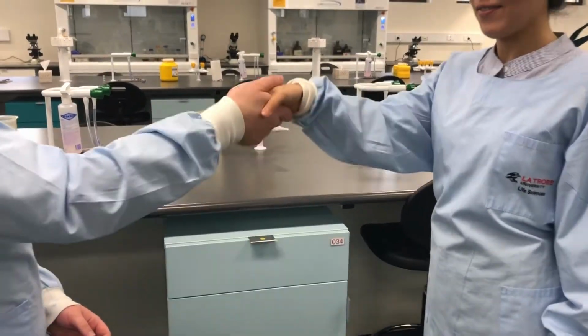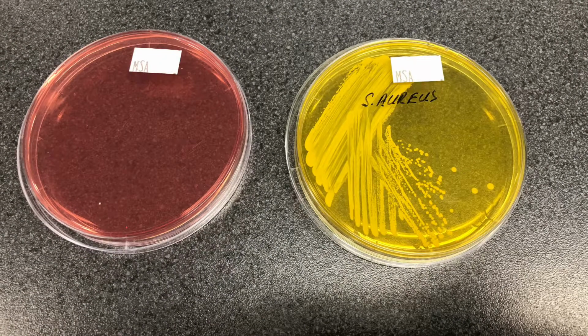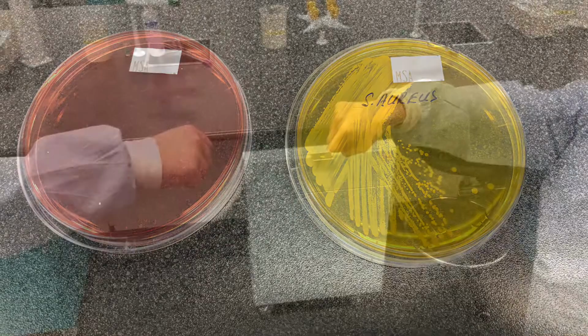We conducted an experiment to determine how efficiently microbes can spread on the skin when handshaking and fist bumping. Pathogens spread through contact and can become a health risk for podiatrists and patients in a clinical setting. Transmission was greater in handshaking than fist bumping due to a larger surface area of contact.